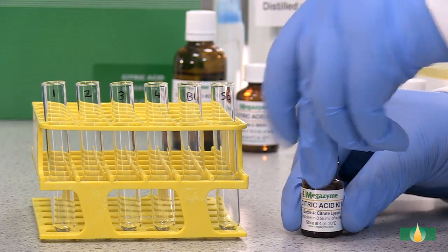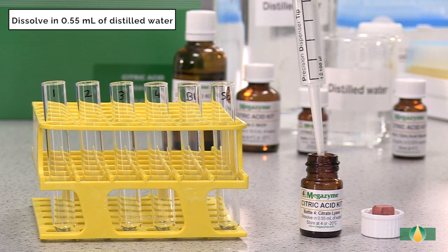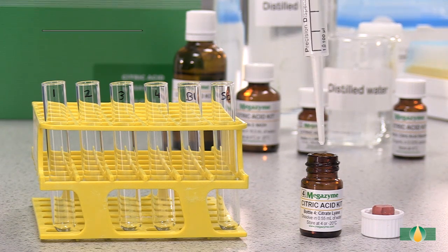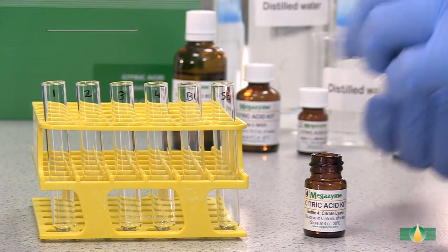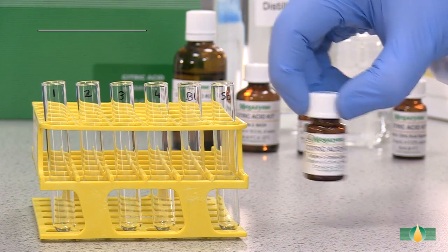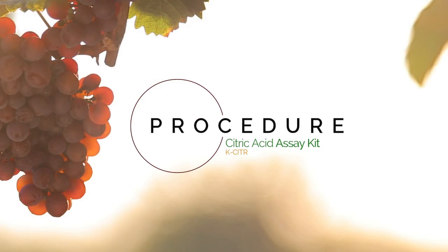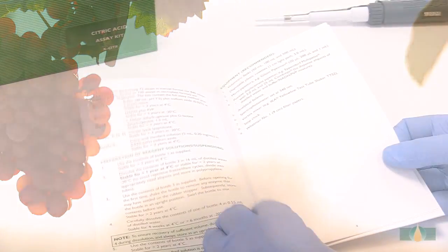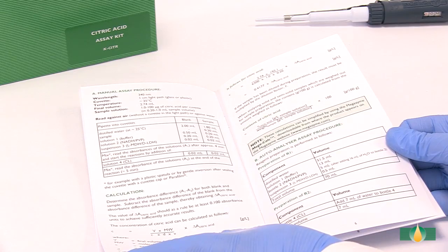The contents of bottle 4 are dissolved in 0.55 milliliters of distilled water. The bottle is capped and the contents are mixed thoroughly to ensure complete dissolution. For longer term stability, do not dissolve the contents of the second or third bottles until required. Follow the manual assay procedure as described in the data booklet.